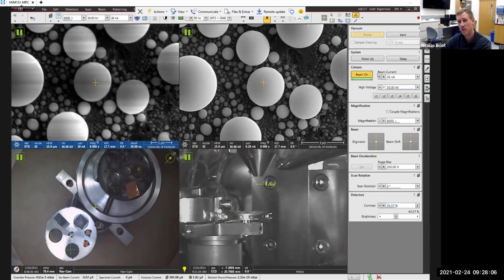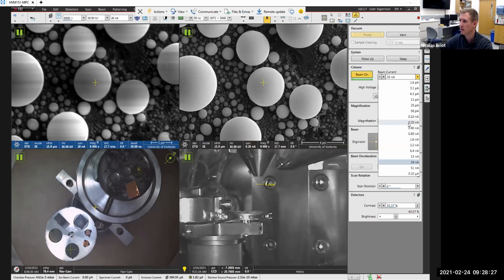Well, same thing as we talked about. If you're trying to do some EDS, some composition analysis, any of those analytical techniques, they need to gather a lot of signal. So if you go with a low beam current, you don't generate a lot of signal, and it's going to take you hours to do anything, whereas right now it would take you a couple of minutes. So everything is a trade-off here. So I'm going to bring that back down.